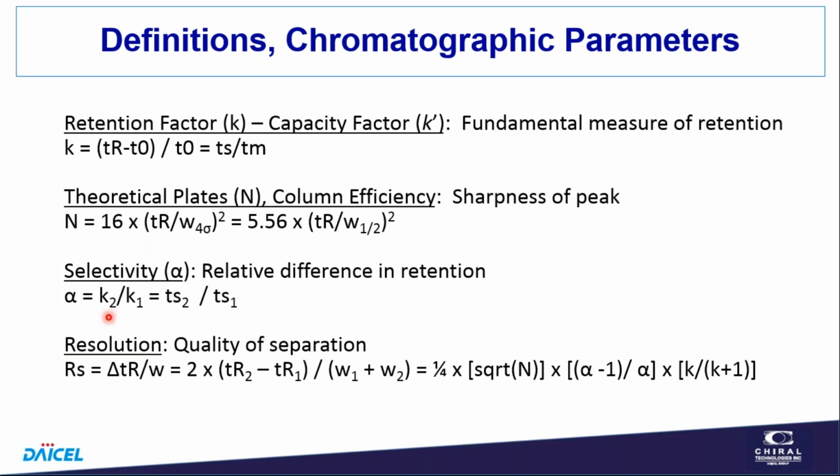Selectivity is defined as a ratio of the retention factors, but everything spends the same amount of time in the mobile phase. It's just the retentions that determine how much time it spends in the stationary phase. So this is just a ratio of the time the two analytes spend in the stationary phase. If they spend an identical amount of time in the stationary phase, they'll co-elute, giving an alpha of 1. If they spend a different time in the stationary phase, it'll be some number related to that ratio. So if one of them spends twice as much time in the stationary phase as the other one, you'll have a selectivity of 2.